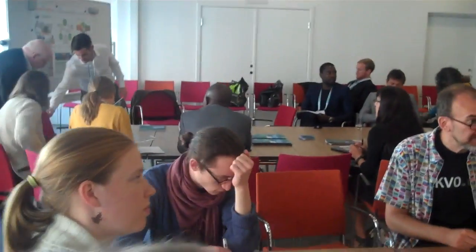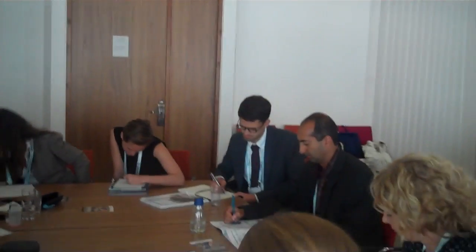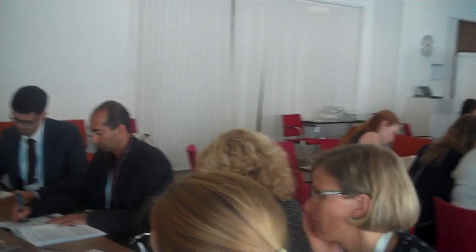Let's get started. What we're going to look at here is a way of doing water quality testing using smartphones, essentially. The traditional way of doing water quality testing tends to be: take the water sample and send it to the laboratory. Pay $100 or something. Two weeks later, get an answer back. And what we want to do is change that.